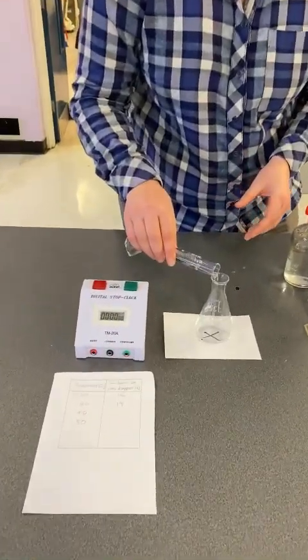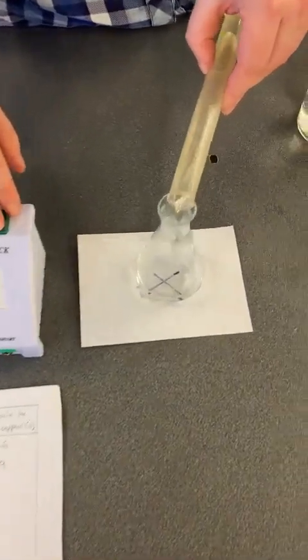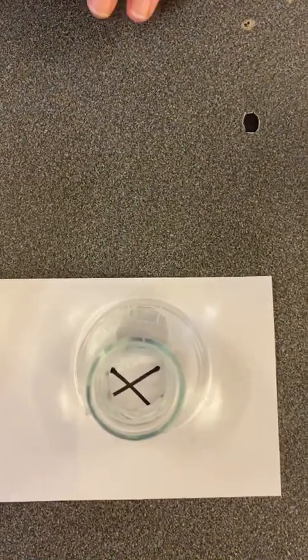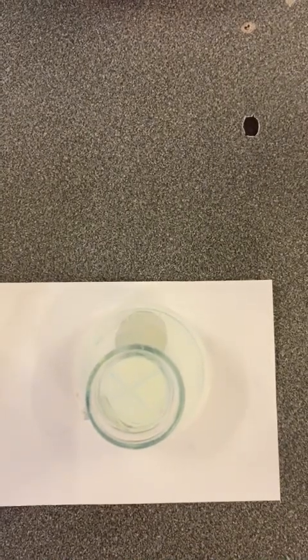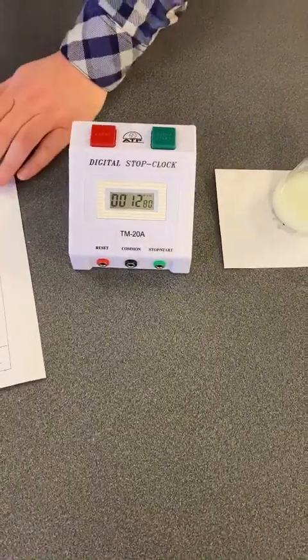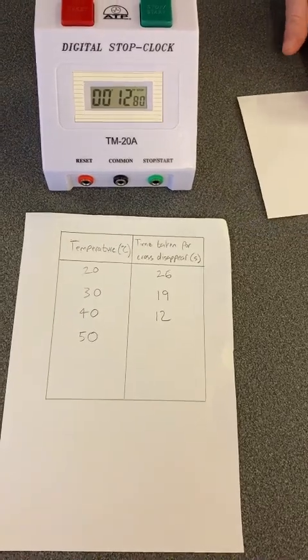Okay, here's my sodium thiosulfate in my conical flask. And ready, 3, 2, 1. Nearly there, and stop. So that took, let's have a look, that took 12 seconds. So at 40 degrees Celsius, it took 12 seconds for the cross to disappear.